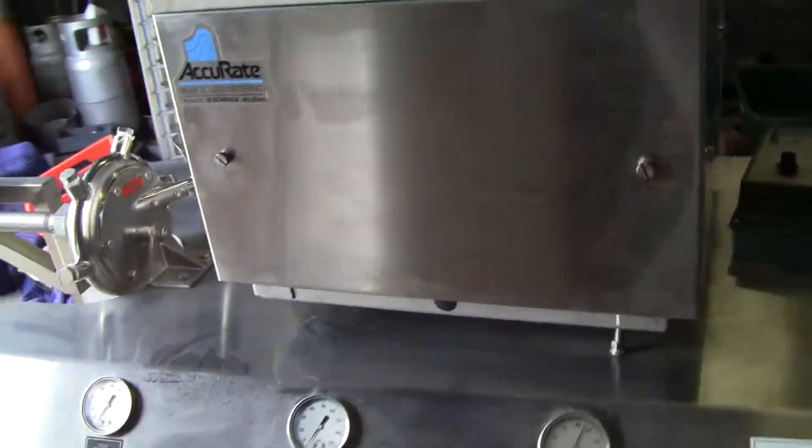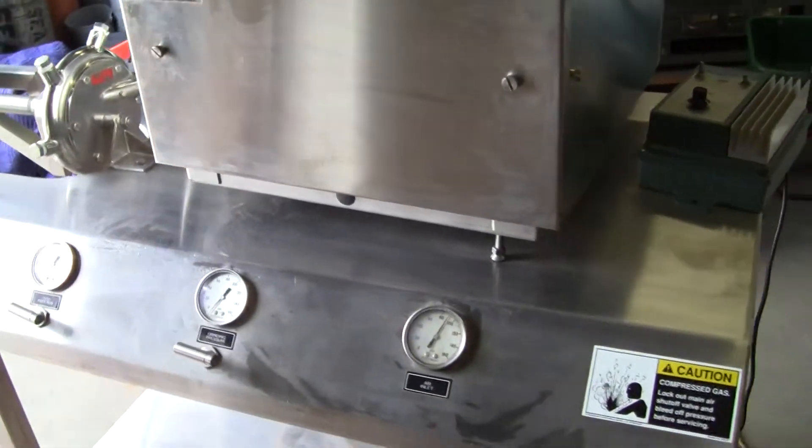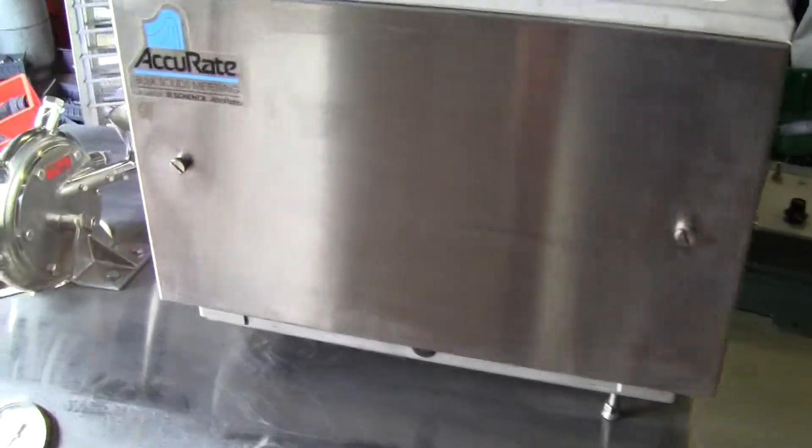Hi, this is Michael McTowell from HitechTrader. Today we are looking at a system feeder and a mill.